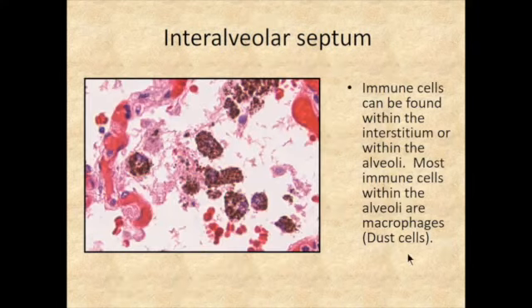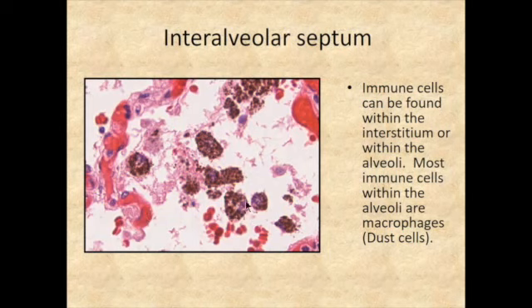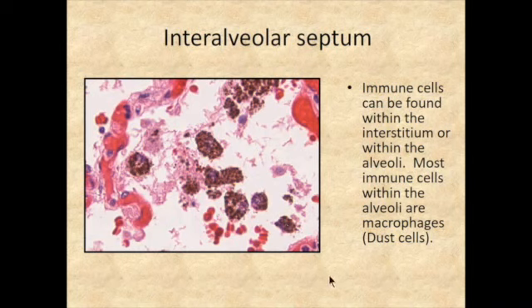Several different immune cells can be found inside the interstitium of the lung — notably macrophages and mast cells, but also eosinophils and other cells. This is a lung from a congestive heart failure patient with very congested pulmonary capillaries. Blood comes out into the alveolar spaces and macrophages ingest those red blood cells to clean up the debris — these are hemosiderin-laden macrophages. Macrophages in the respiratory system are commonly referred to as dust cells.